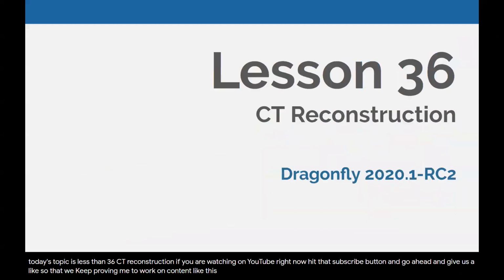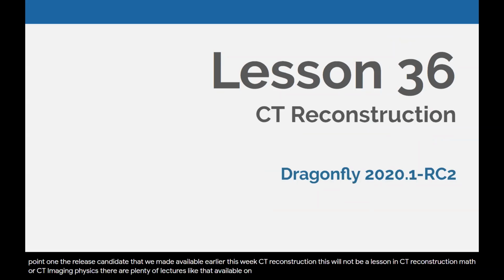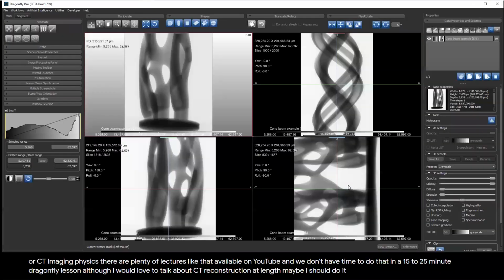Lesson 36 CT Reconstruction. This will be done using Dragonfly 2020.1, the release candidate that we made available earlier this week. CT Reconstruction. This will not be a lesson in CT Reconstruction math or CT imaging physics. There are plenty of lectures like that available on YouTube, and we don't have time to do that in a 15 to 25 minute Dragonfly lesson, although I would love to talk about CT Reconstruction at length. Maybe I should do a lecture series on that.